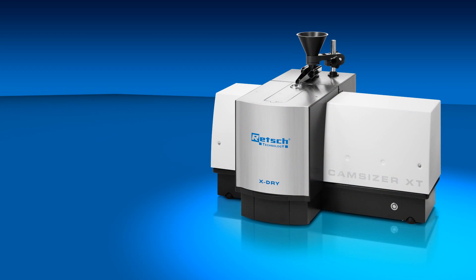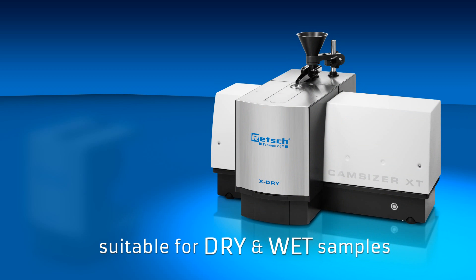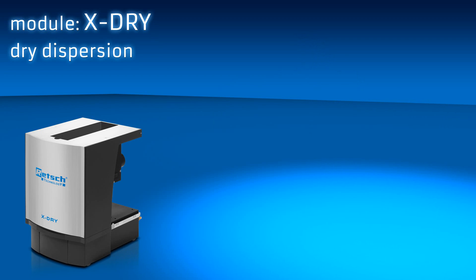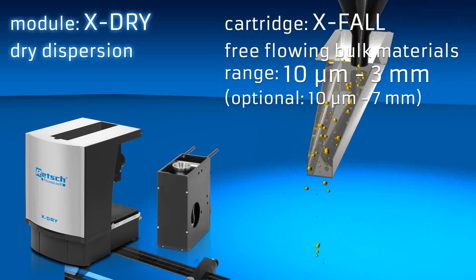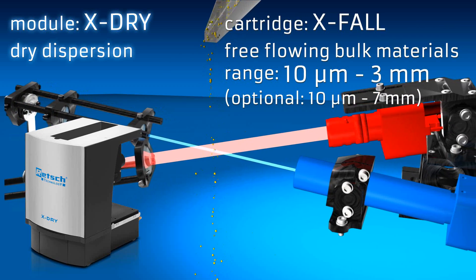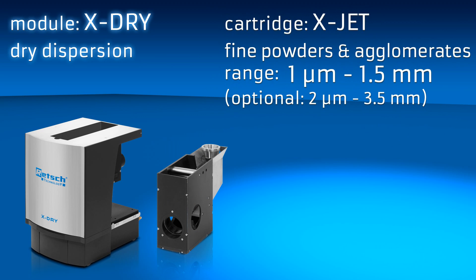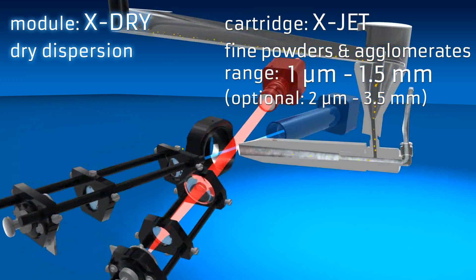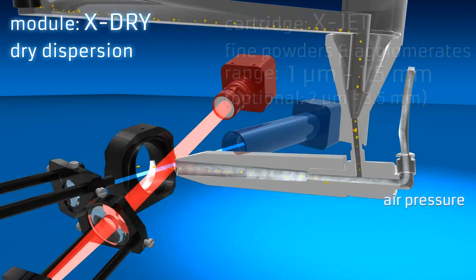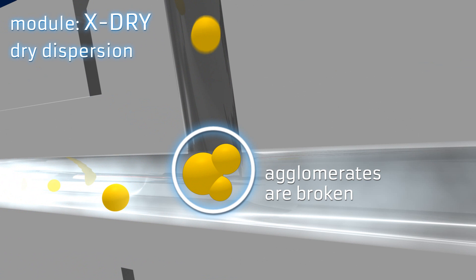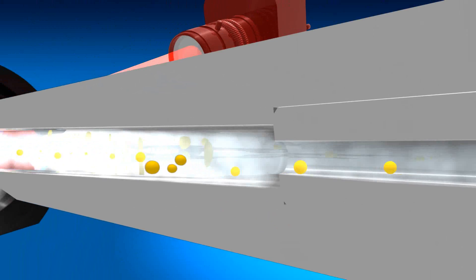The CamSizer XT is suitable for dry and wet samples. It offers two modules with three different methods of sample dispersion. The Dry Dispersion Module X-Dry can be equipped with two different cartridges. The Gravity Dispersion Cartridge X-Fall is used for pourable and free-flowing bulk materials in a size range of 10 micrometers to 3 millimeters, and the whole sample can be recovered. The High Pressure Cartridge X-Jet is suitable for fine powders and agglomerating samples in a size range from 1 micrometer to 1.5 millimeters. The pressure cartridge disperses the sample material by air pressure, and the strong air stream ensures that agglomerates which would falsify the measurement results are broken before they enter the measurement area.